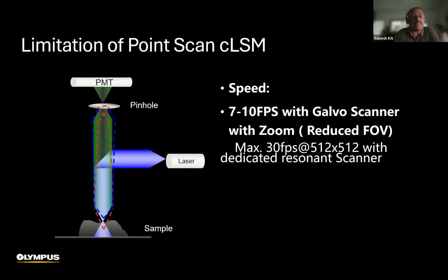The detector that we are currently using with the confocal microscope is not the conventional camera, which is a multi-pixel detector. Since you are exciting only one pixel at a time with a point light source, your detector is also a point detector called a photomultiplier tube. With the minimal amount of signal that you are collecting, the photomultiplier is able to amplify the signal by applying an external voltage, thereby enhancing the signal. That's why we call it a point detector or photomultiplier tube, where it collects the signal from each point, amplifies the electrons and finally converts it into digital information.